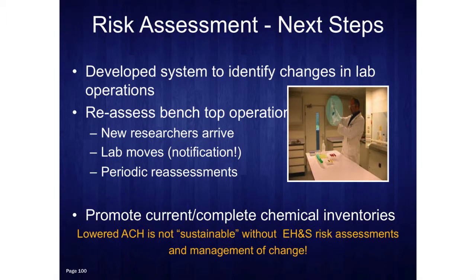So to date, this is the results of our benchtop assessments. So we're finding that about 80% of our lab rooms can have air change reductions.